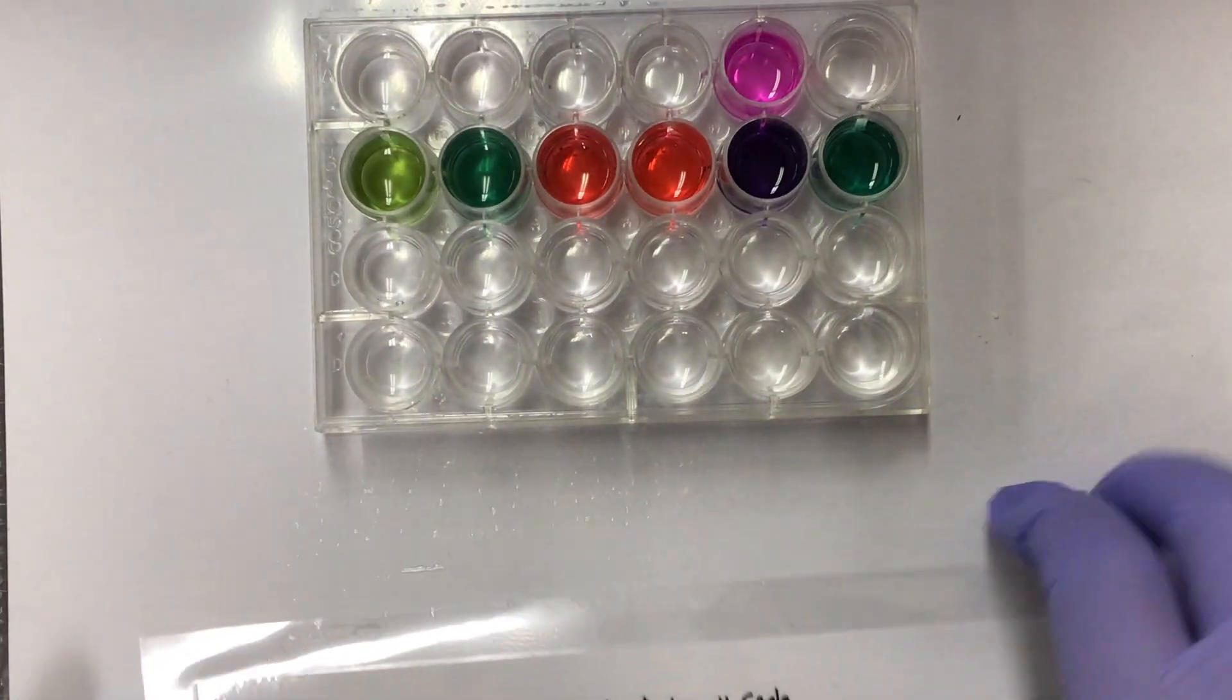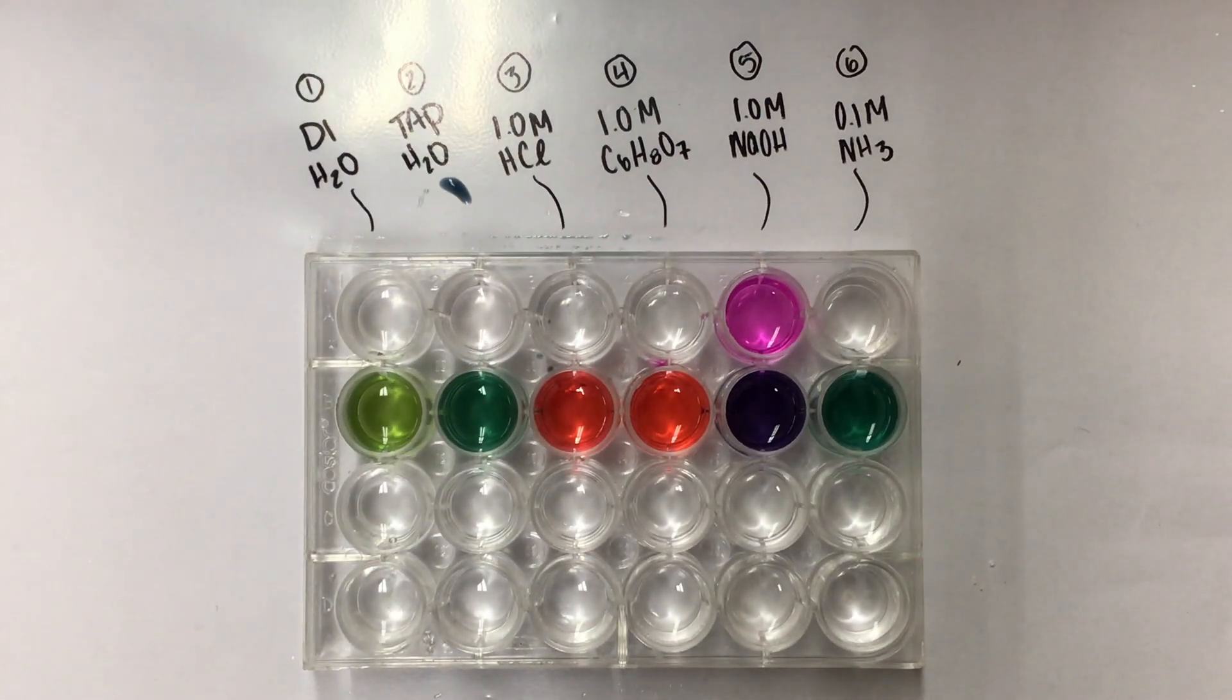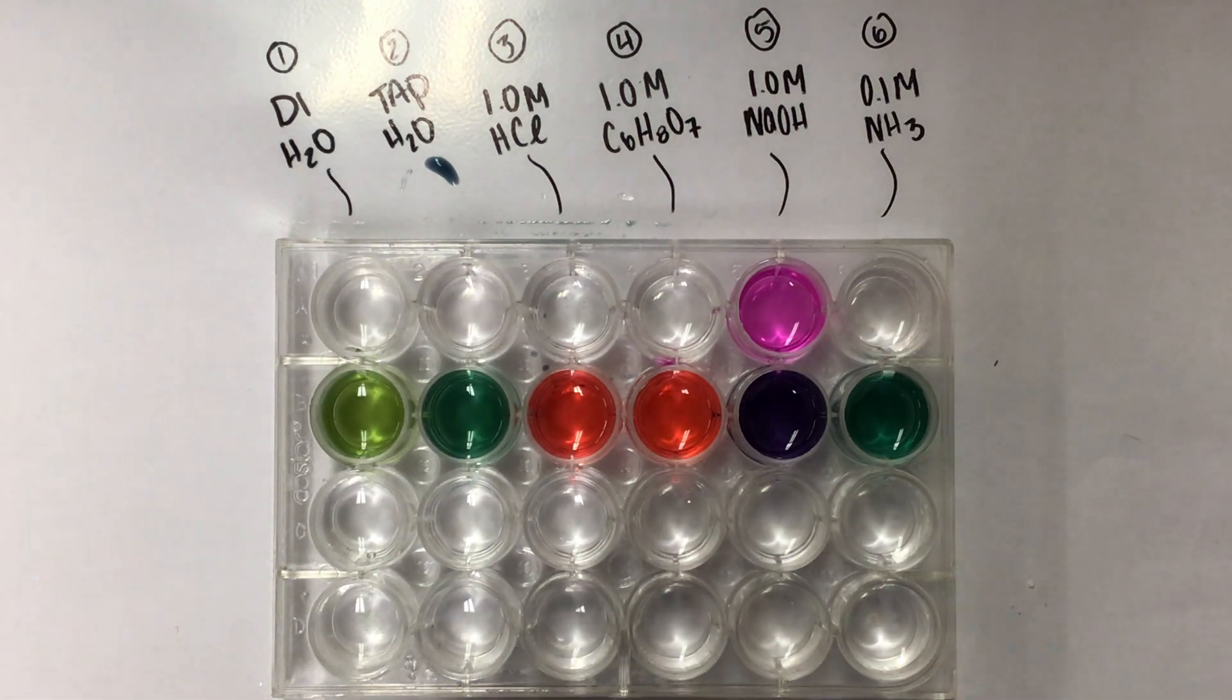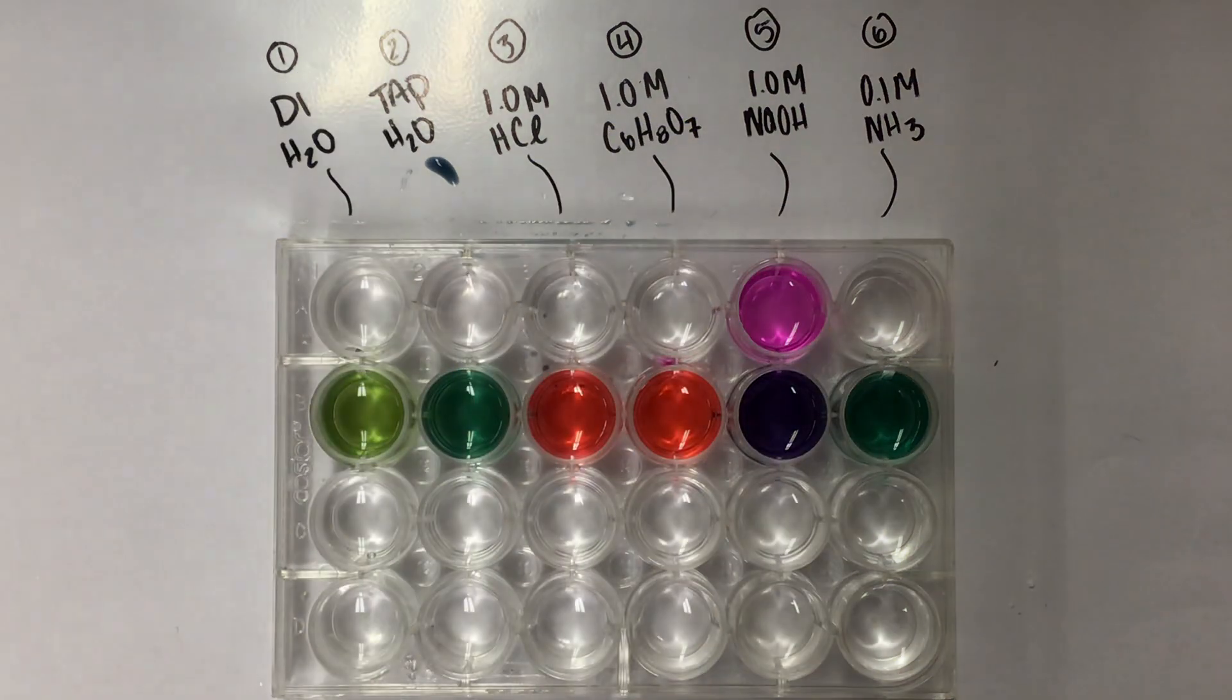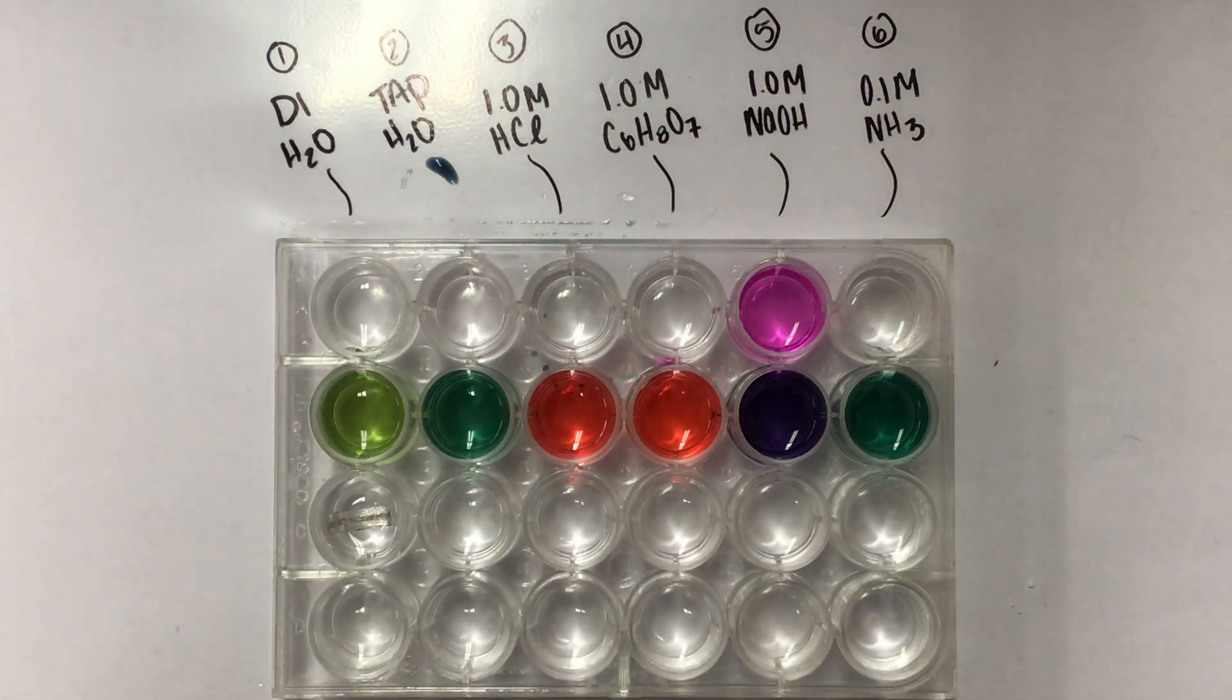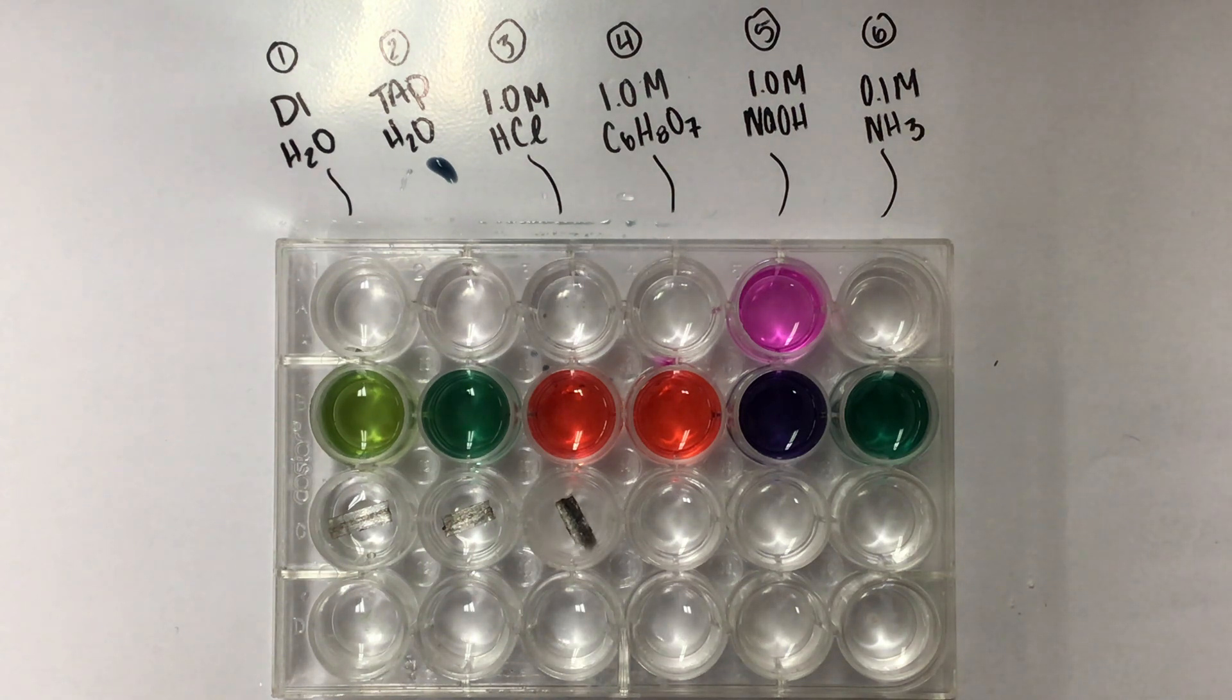In the third well we're going to test the reactivity of these different substances with a piece of magnesium metal. The magnesium metal is coming in these little ribbons right here. I'm just going to take one small piece of it, drop it into each of the wells. Hopefully you can hear some of that sizzling, some of that bubbling.